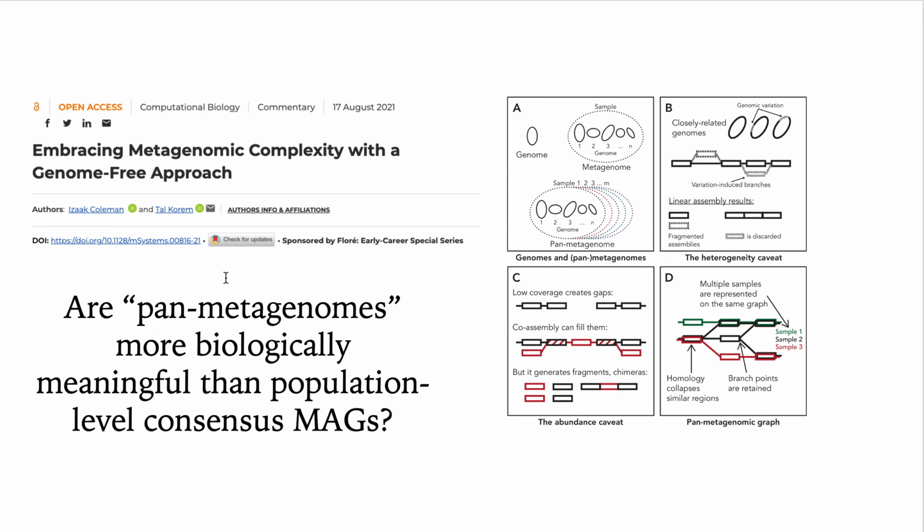And so finally, I just want to leave you with a bit of a thought exercise when we're talking about MAGs and binning out genomes from metagenomes. It sounds really, really simple, really great, and we often think of different microbial taxa as being these sort of distinct genomes floating around in the environment.